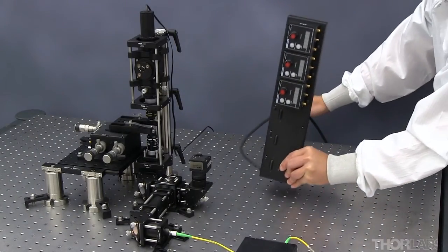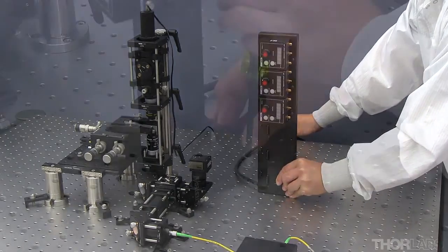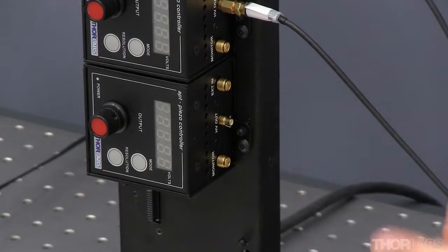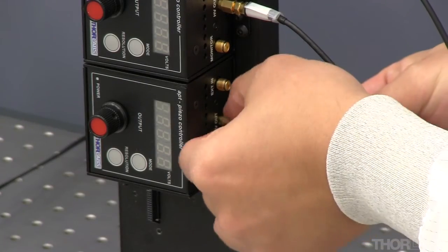Place the T-Cube hub on the table out of the way of the OTKB system and secure it to the table. Plug in all the appropriate cables and power cords.